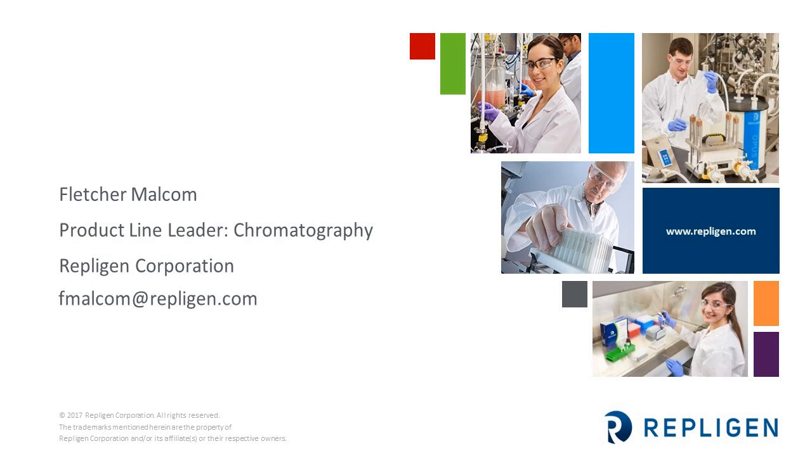In the future, could they be more combined, perhaps, or more integrated, perhaps? But you still always have to be able to change out the columns. So you still have a piece of the equipment, even if it was in a chromatography column format, that would have to be pulled out and then installed again. So perhaps better integration is something that we can work on as an industry in terms of that system and the column, or more seamless integration, I think is something we can work on. But full integration, that could be slightly challenging, depending on how you think about it.